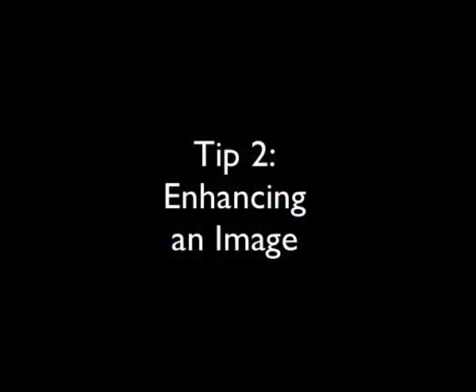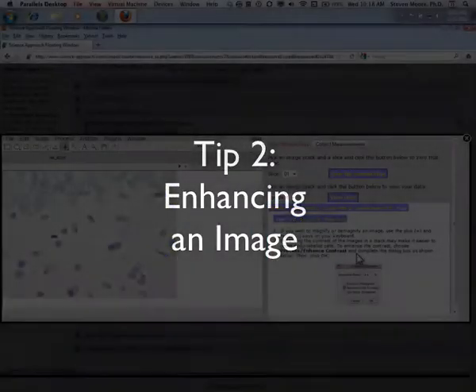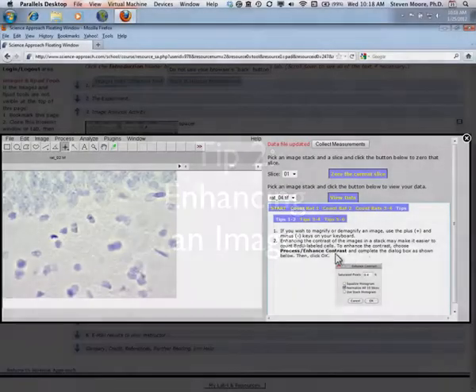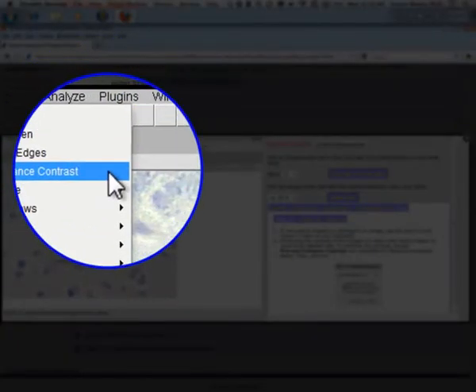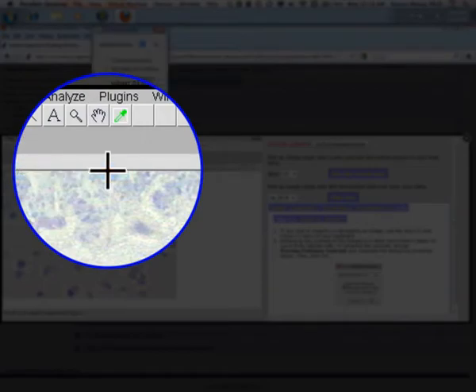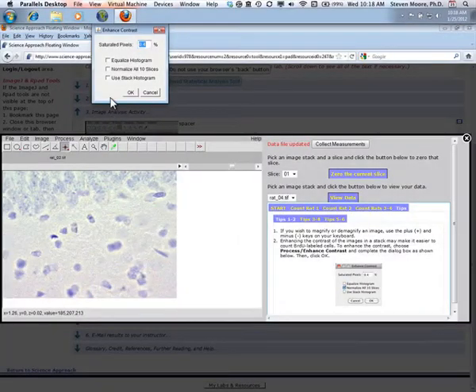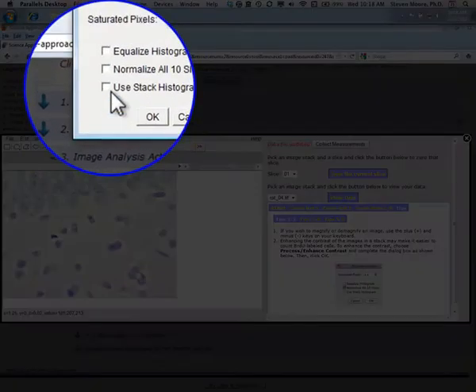To enhance the contrast of an image to make it easier to count cells, choose Process Enhance Contrast and then complete the dialog box as shown in the instructions.